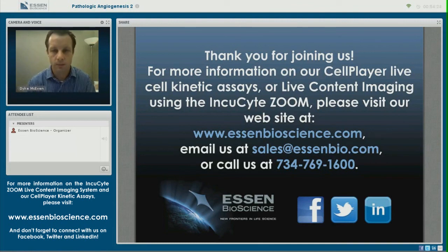There's another question here about the cost of running assays at your facility, and this depends on the complexity of the study and how many plates we're running. Typically the cost of running a single plate at our facility is $5,400.